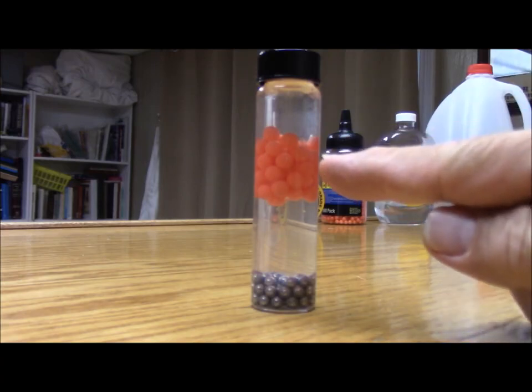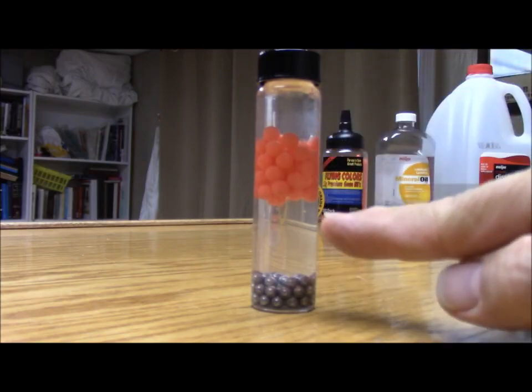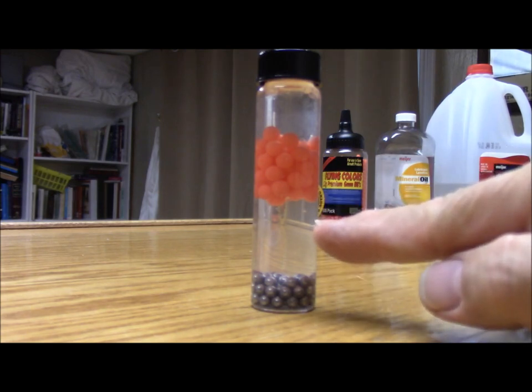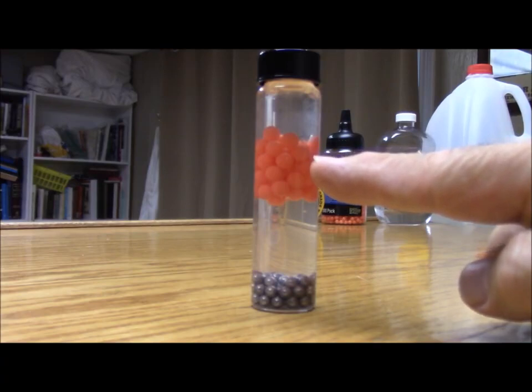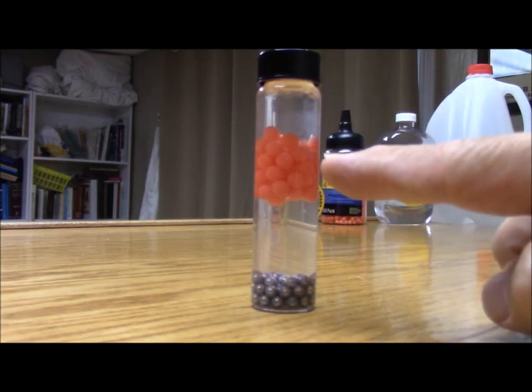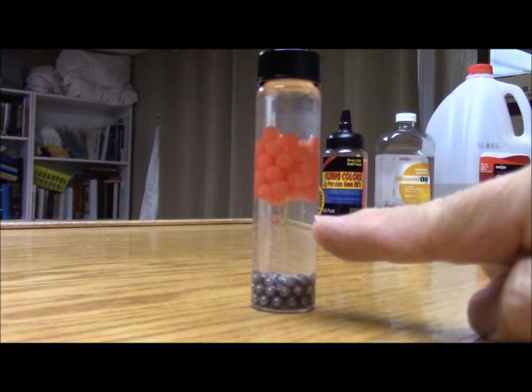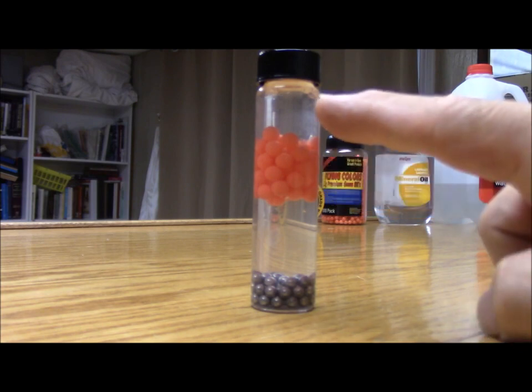It appears that the orange objects are trapped between the upper liquid layer and the lower liquid layer. So, first question after that. Are these orange objects more dense or less dense than water? And remember what I said up in the first paragraph on this side. Water is more dense than mineral oil. So are these orange objects more dense or less dense than water? Circle your answer. Next question. Are these orange objects more dense or less dense than mineral oil?